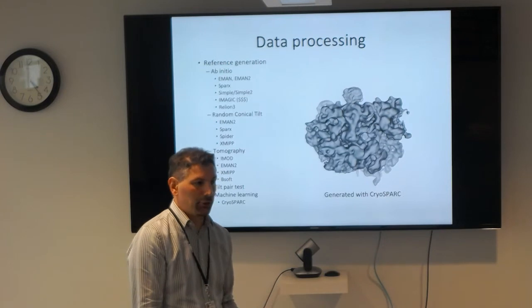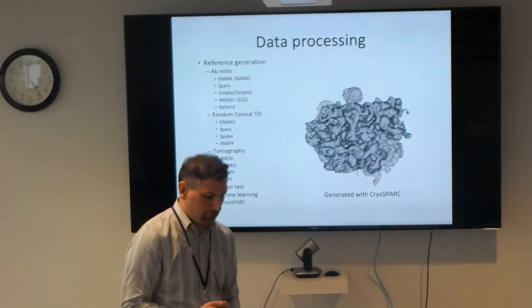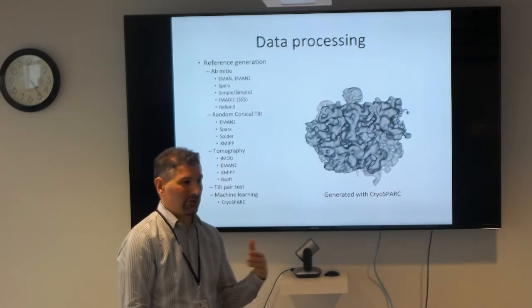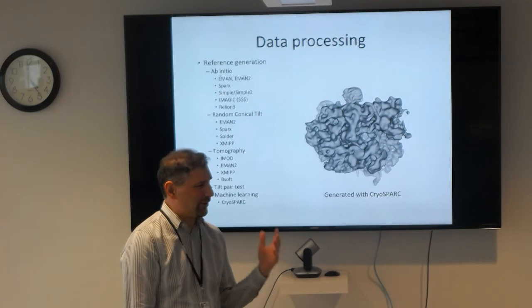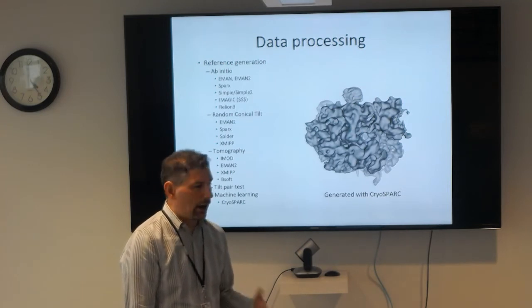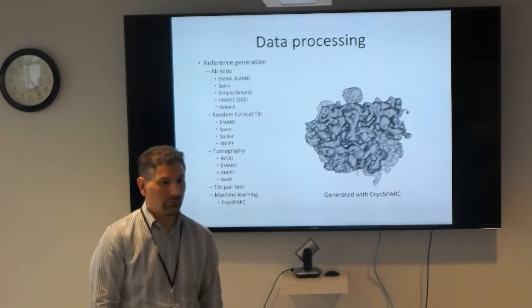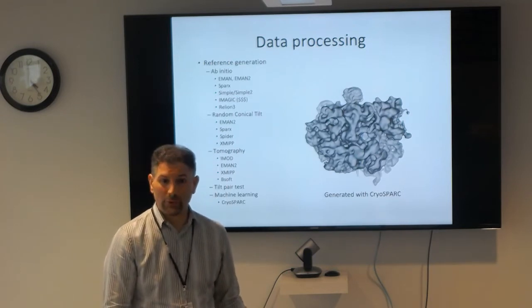So if you have something in your buffer that affects that, and also if you have situations where your defocus values for your CTF estimations are poor, and every power spectrum is poor, and you're desperate, like, oh, I'm going to process stain instead, I always see spikiness for a data set like that. Okay? Other questions? No. Okay.